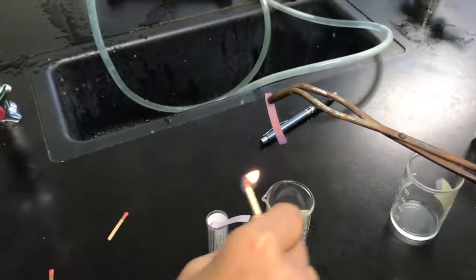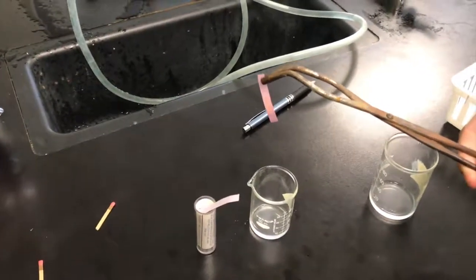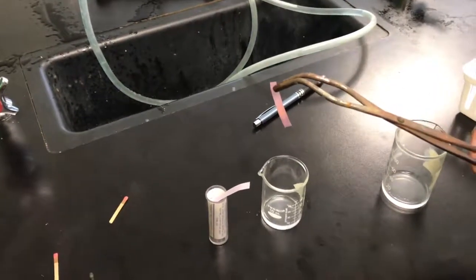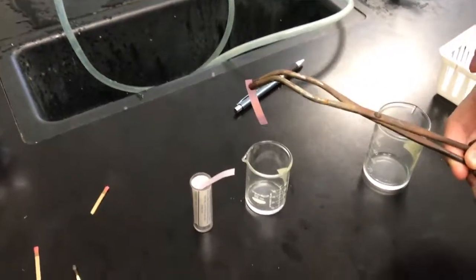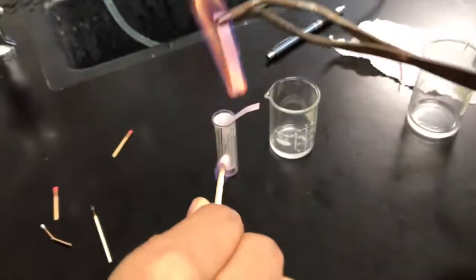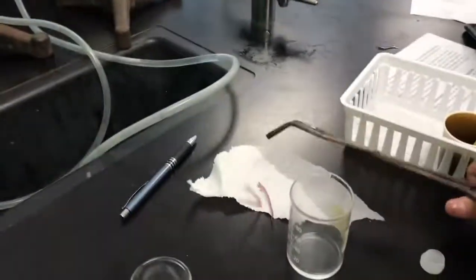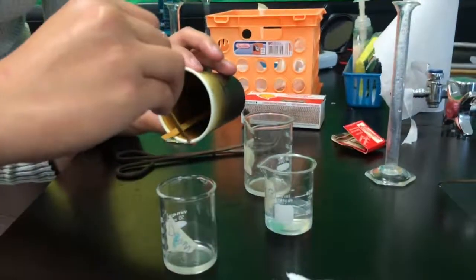To determine its flammability, we first dipped a piece of paper into each of the substances and then lit it on fire with a match. If the paper held the flame and then put it out, the substance was flammable.